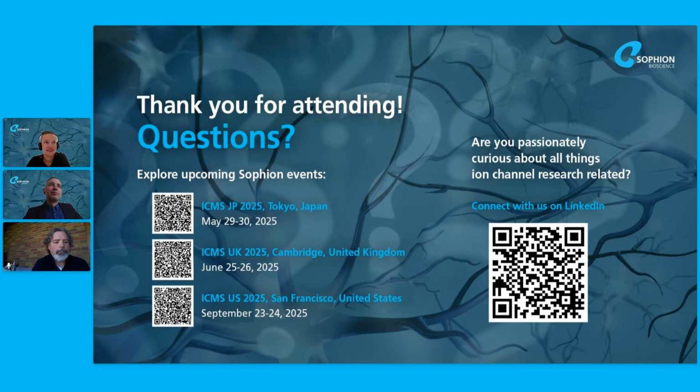Yeah, so the success rates are always different from cell line to cell line. So for example, the gluteneurons that Scott just mentioned, they run at about 75% success rates. So there's always that factor that every iPSC-derived cell line that we work with has different challenges and different success rates. In general, if you have more cells, so you can work at higher density, that tends to increase the success rate.